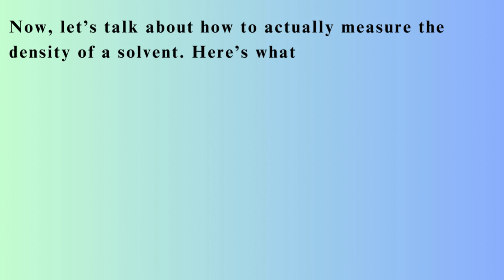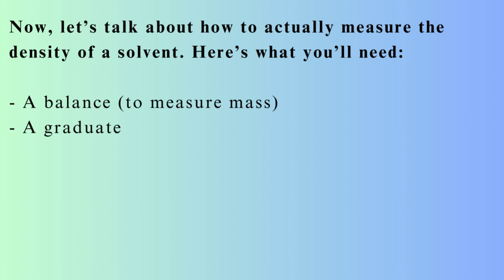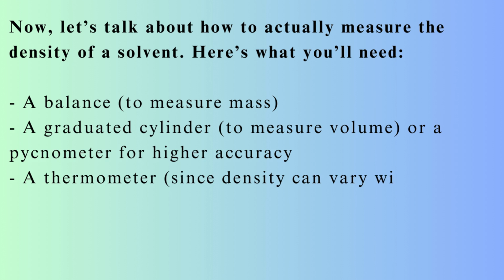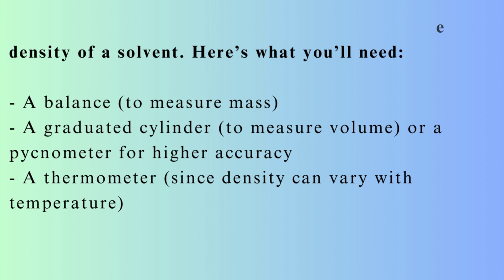Measuring the density of solvents. Now, let's talk about how to actually measure the density of a solvent. Here's what you'll need: a balance, to measure mass, a graduated cylinder, to measure volume, or a pycnometer for higher accuracy, a thermometer, since density can vary with temperature.